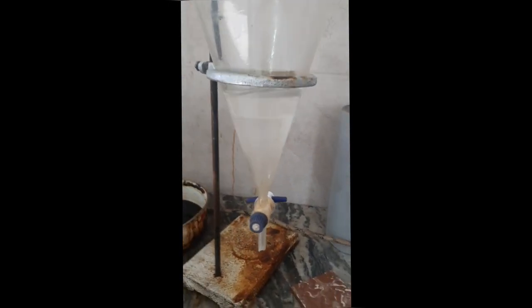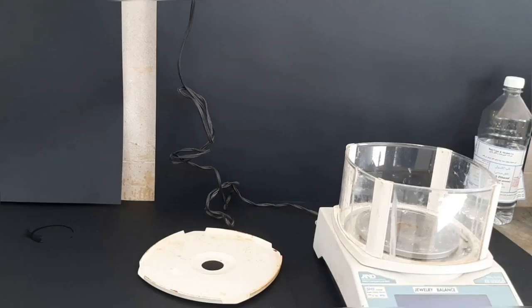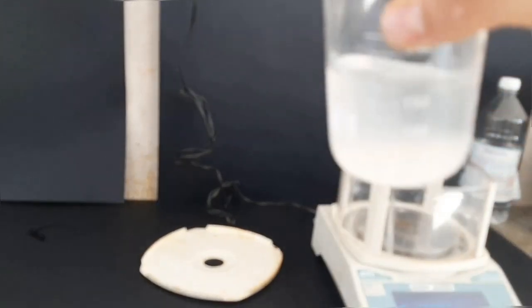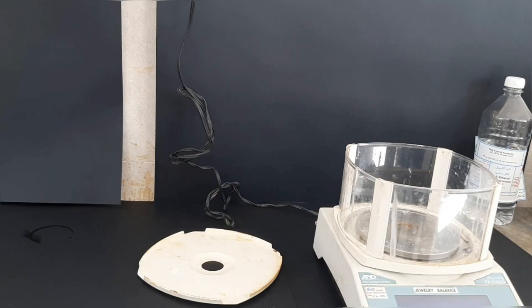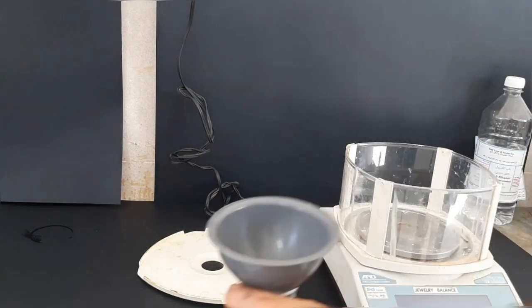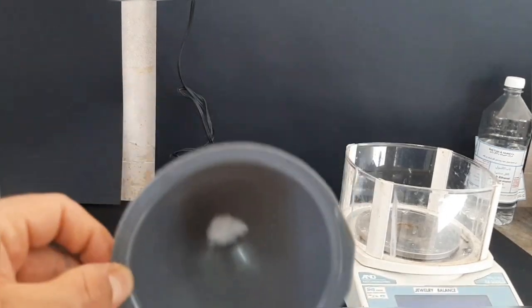We're gonna separate the top layer as our product and filter it because it's a little bit murky. So this is our product, our dried and purified product. It's just a little bit cloudy. We're gonna put some cotton in a funnel and filter it.